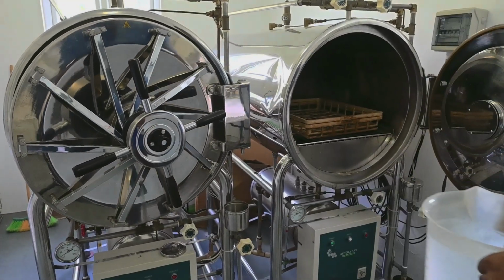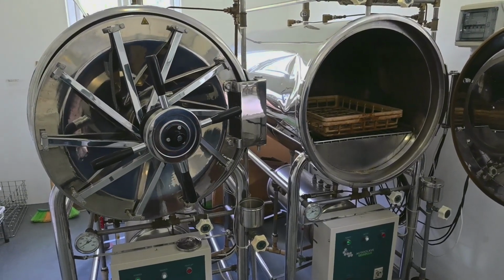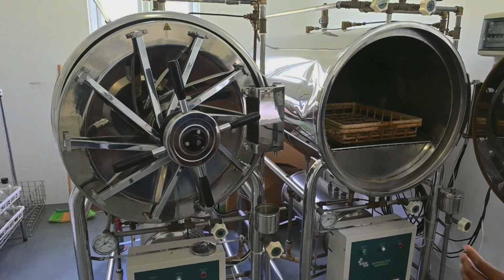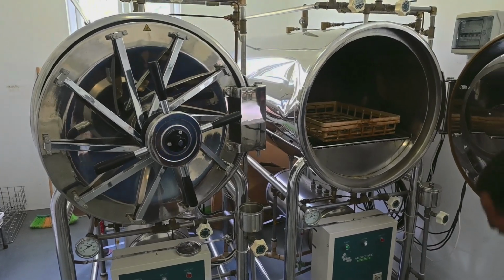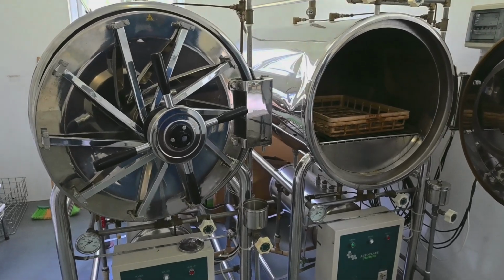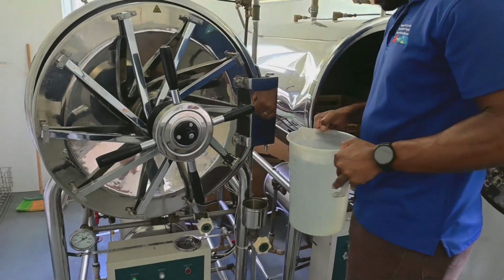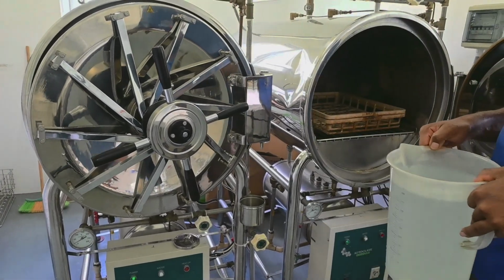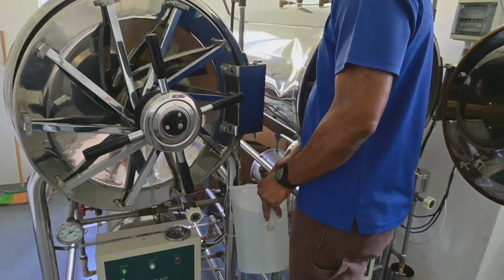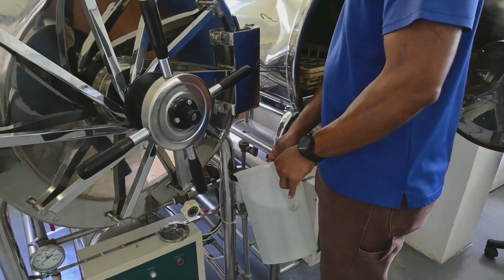There is a water gauge at the bottom, and we use it to see the level of the water. It must be within a particular range. Anything below that, the machine will shut off automatically to prevent itself from being damaged. And anything above that, it releases the excess water on its own. So you have to be within the range for operation. So it's filled here.